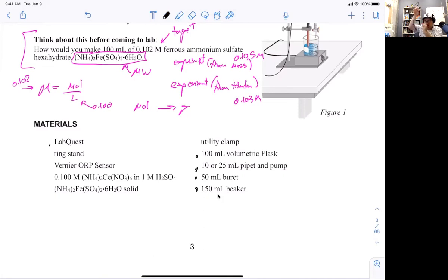Don't try to touch the glass membrane with the paper. That doesn't really work that well. Never touch that glass membrane. They're too easy to break. Hose it down, dry it off.